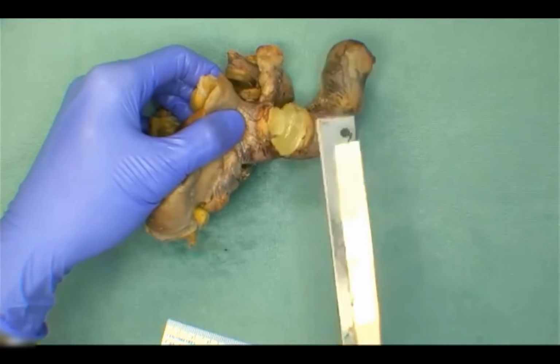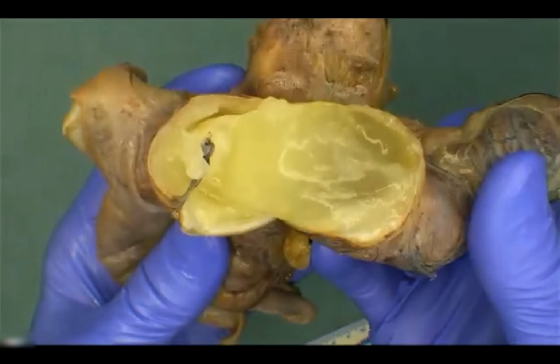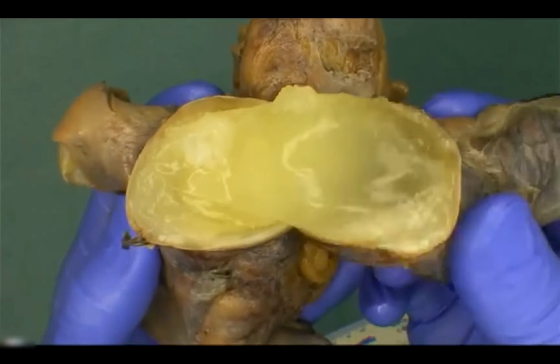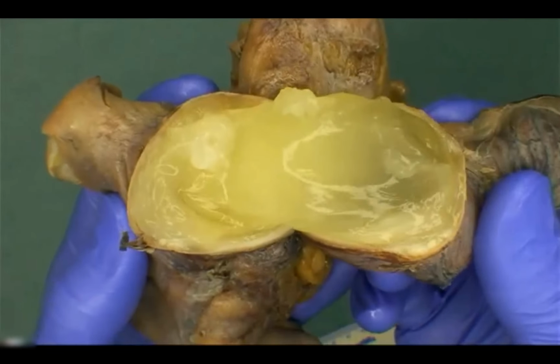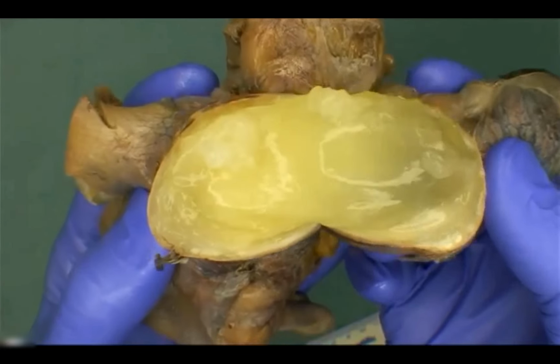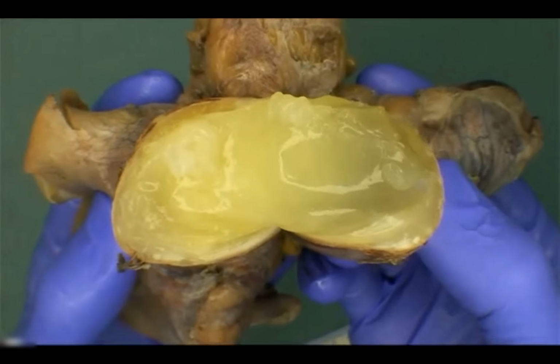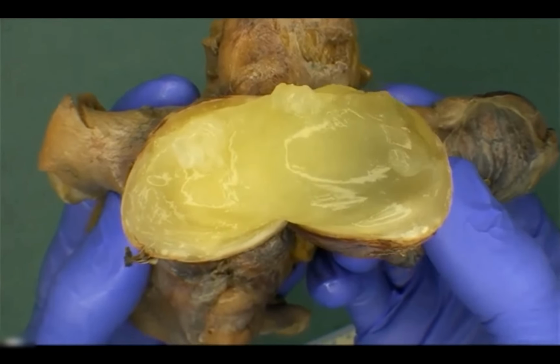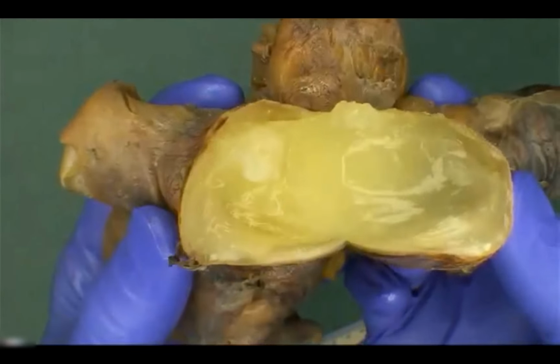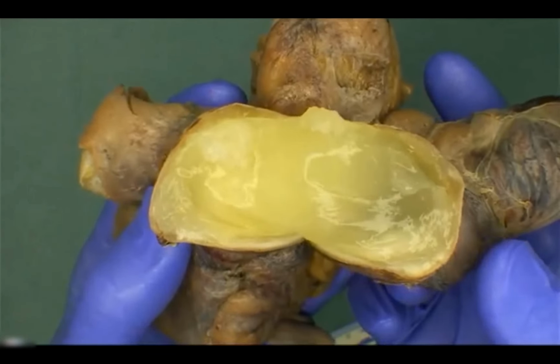Very nice. Okay, let's get some gross descriptors of what we're seeing here. We've just got the one cut, but I think we can. Had breakfast too. Maybe folks are having breakfast, in which case we're honored. We've got semi-solid, we've got gelatinous, we've got white and yellow. It does look a little bit clear, doesn't it? This part on the right-hand side, a little bit translucent. Good. Okay, what are some other descriptors of what we're seeing on cut surface? Any pertinent negatives, folks? The wall is thin.